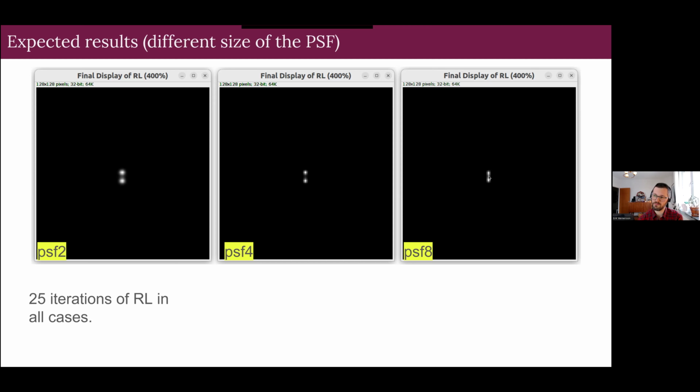And now this is the simplest PSF you can use. So imagine using something more complicated with a diffraction pattern, you will maybe appreciate the dangers, or we need to have a PSF model that matches what you have in the scope. So inspect the data, look at beads, see how it looks, and make sure that the PSF you use matches what you see in the scope.